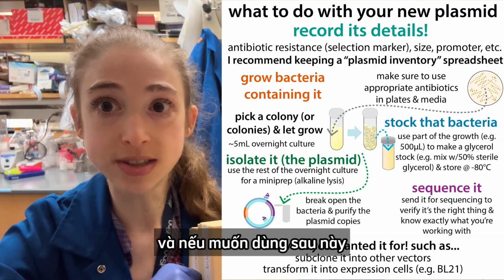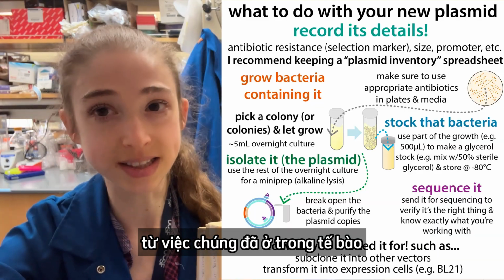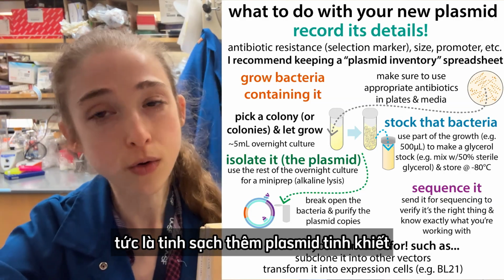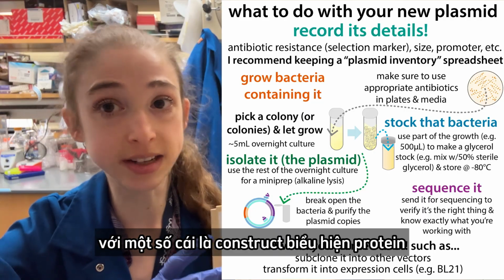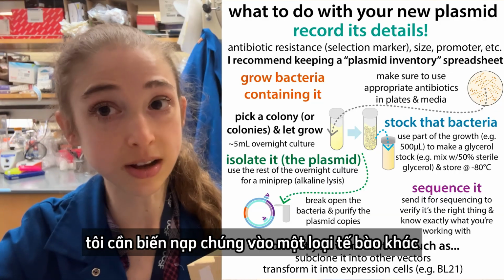And then if I want to use them in the future, I can skip the transformation step and go straight from them being in the cells. And I'll take the rest of the culture and I'll mini prep them, so I'll purify more of the pure plasmid out of it. Now for some of these, for protein expression constructs, I'm actually going to need to transform them into a different cell type.